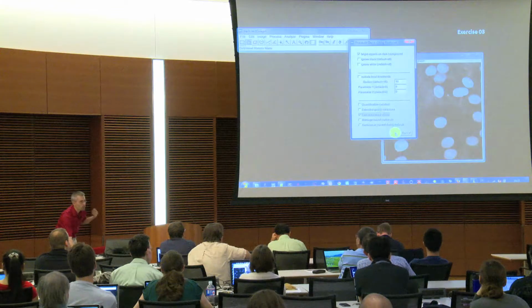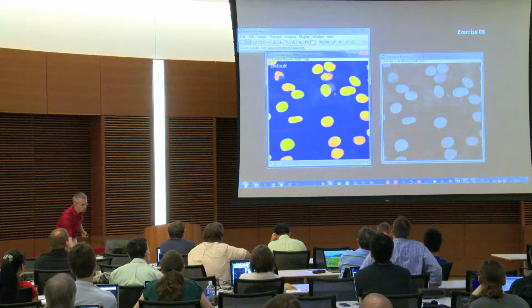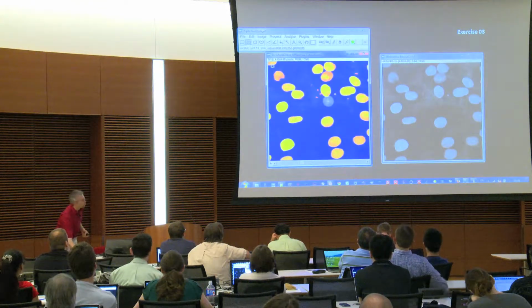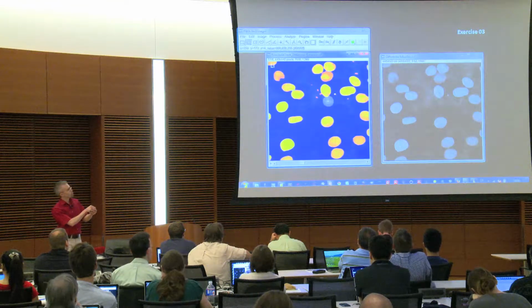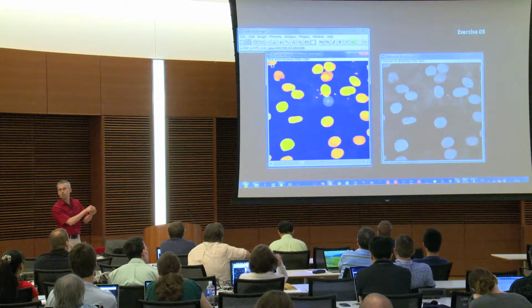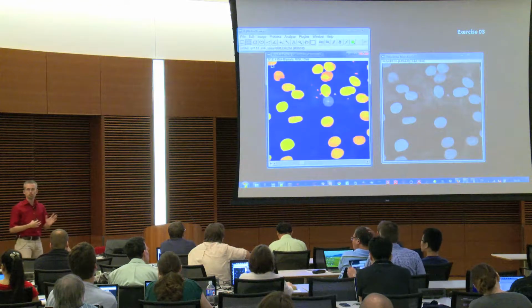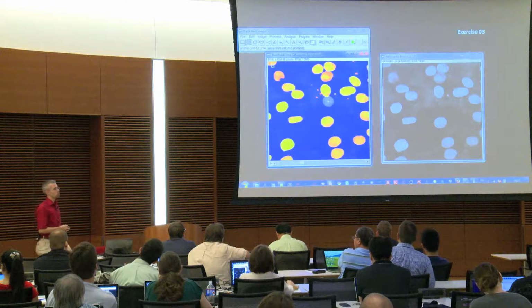If I now run that, pressing OK, you see it looks the same. But if we go through, then you see that actually now, which was not the case beforehand, between those objects we have blue lines, which is background, blue is background, so that is basically the cut-up part here, which uses the normal watershed function.